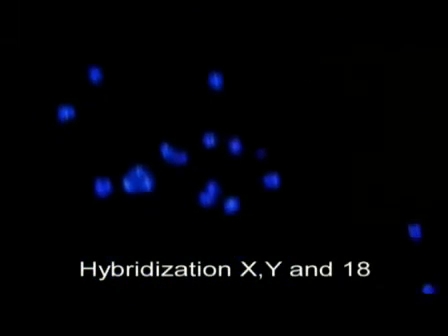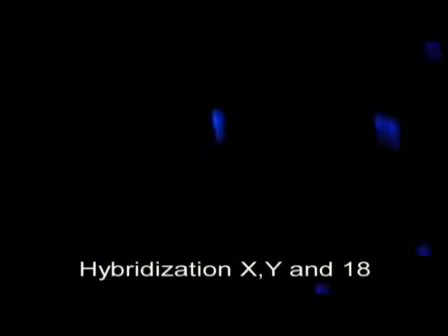Through the triple band filter, the preparation hybridized with X, Y and 18 displays signals for these three chromosomes.